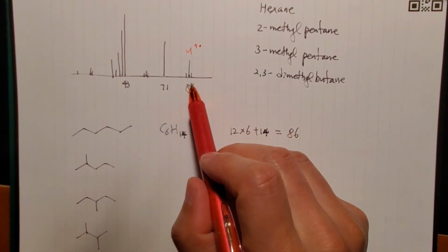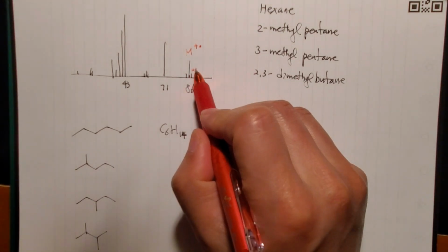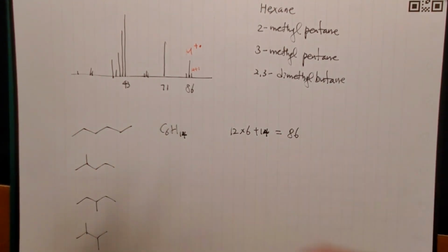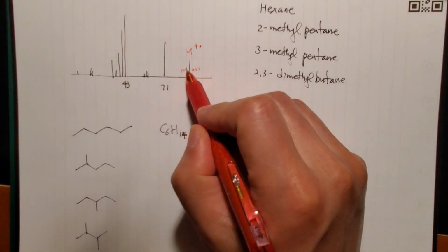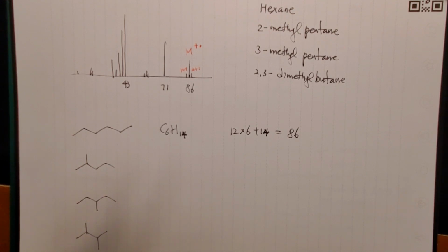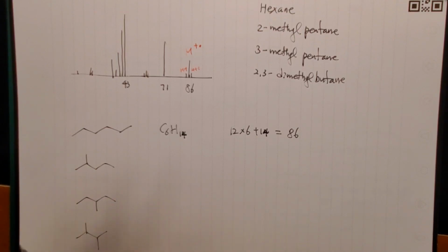Then you examine the isotope peaks, and the M+1 is not significantly big, and there's no M+2, meaning there are no heavy atoms. I mean, obviously there's no heavy atom, but I'm just trying to remind you. And also M-1, the presence of an aldehyde, right? After losing the hydrogen of an aldehyde, it's also not very significant, so there's no aldehyde. Then you have a base peak during the analysis of the fragmentation. The best structure that explains this phenomenon will match the spectrum the best.